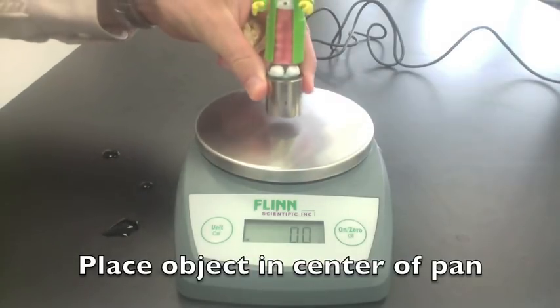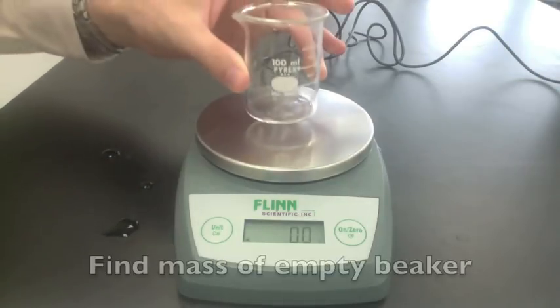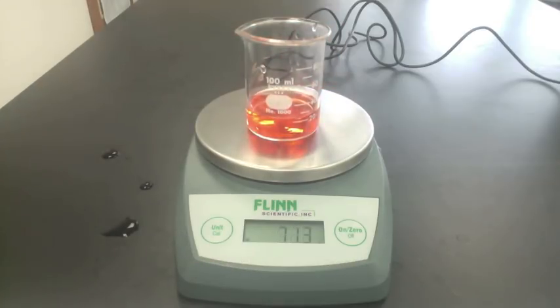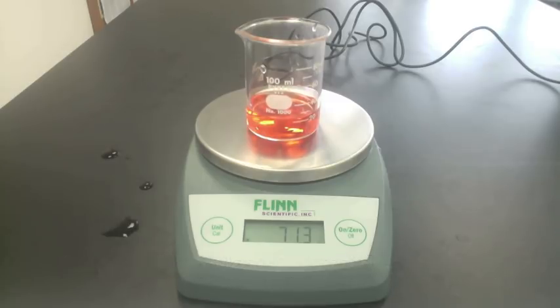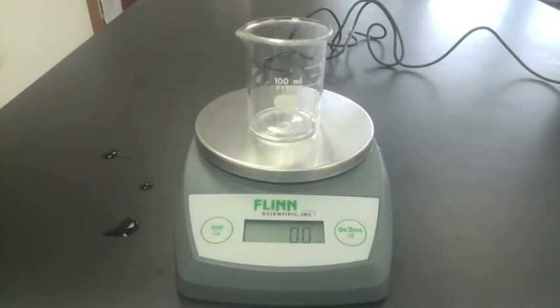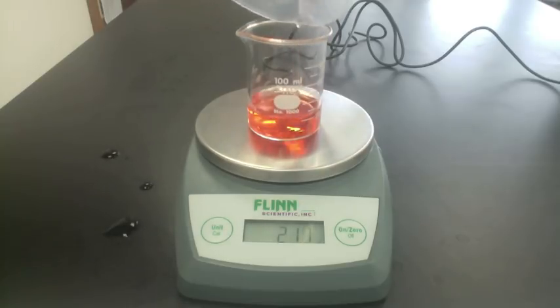To find the mass of an object, place it in the center of the pan and the scale will tell you the mass. To find the mass of a liquid, you can find the mass of an empty beaker, then find the mass of the beaker with the liquid in it, and subtract the two values. Or, put an empty beaker on the scale and hit the re-zero button to cancel out that value. Then when you pour in the liquid, you'll be taking the mass of just the liquid — no subtraction is needed using a digital scale. The computer does it for you.